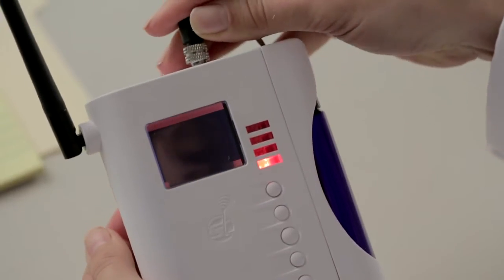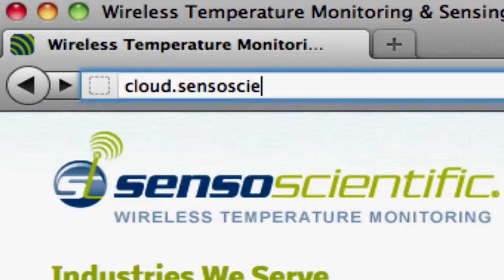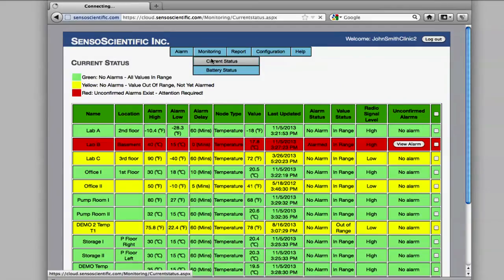Now, hop on your computer or mobile device. Log into the Senso Scientific cloud site on your internet browser and you're ready to start receiving temperature readings from virtually anywhere.